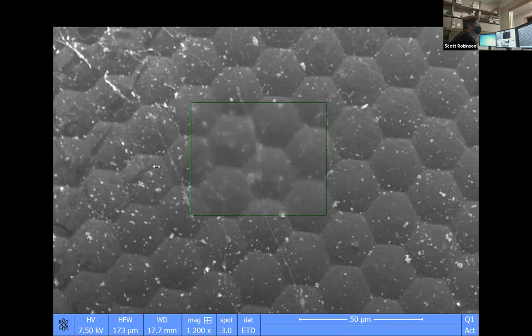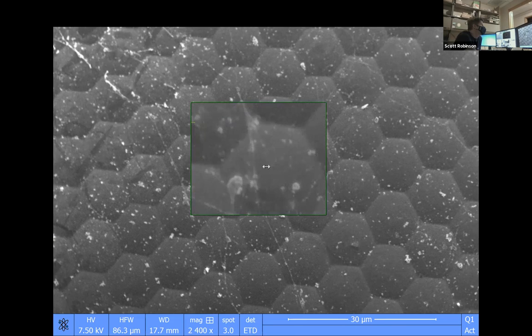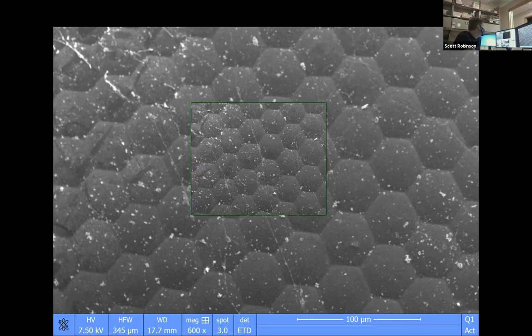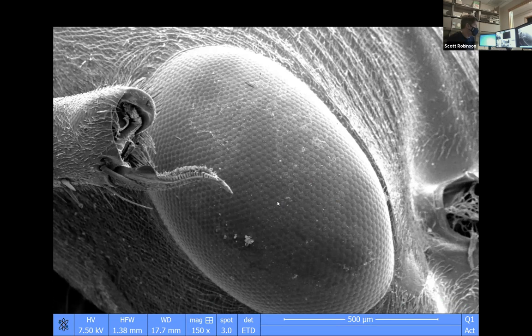So we can see that there's some web on this. Yeah, you think it's actually web, or maybe it's like a fungal hyphae or something? They're smaller than fungal hyphae, I think, according to me. But these are really complex, good eyes. They're much better than the ones that look like raspberries that we've seen. And so from seeing the eyes like this, you can see that they can see very well.